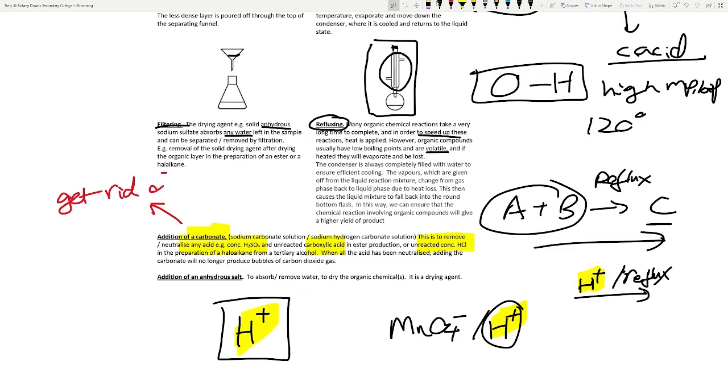Okay, so the carbonate is simply there to get rid of all the, it could be different scenarios as you could see, but I want them to get rid of H pluses. And how do you know the job is done? You no longer make bubbles. Okay, so that's a very common thing to do in the laboratory, because you don't want your solution to be highly concentrated with H2SO4. That means if you need to do further reactions, or if you're handling it, it's not the best thing you want in the world.